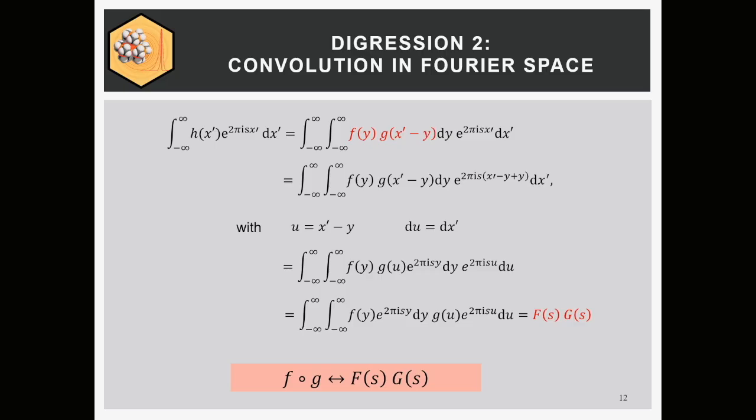Just remember this. If you do the Fourier transformation, you can read this basically at home, so you get the talk, but this is the most simple derivation. So here your h(x') is the convolution function. This whole thing here is the Fourier transformation of the convolution function. You do a couple of little mathematical tricks here, which are very simple and very easy to follow. And if you do this, it turns out at the very end that the complex convolution in direct space is nothing else than the product of the two functions in Fourier space.